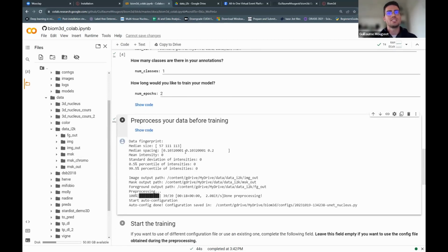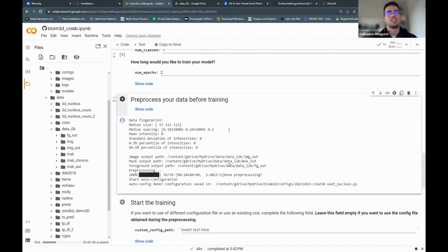And if you actually, this is the determinant step. If you have the green arrow here, you're actually good to go with your images. I try to make sure that plenty of cases are taken care of. Like if your channel, for example, in 3D images, you have different order. You have in your dimension of your image height, width, depth, and channel, and sometimes you have the channel in the beginning. So I also try to take care of that, and many cases like this.